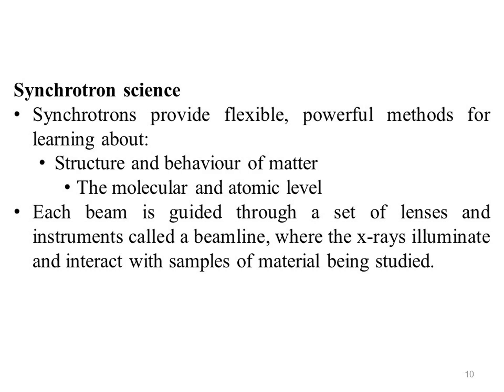Each beam is guided through a set of lenses and instruments called a beamline, where the X-rays illuminate and interact with the samples of material being studied. Many countries operate synchrotrons. There are 10 in Europe alone, but only 4 worldwide are similar to the European Synchrotron Radiation Facility in terms of design and power.